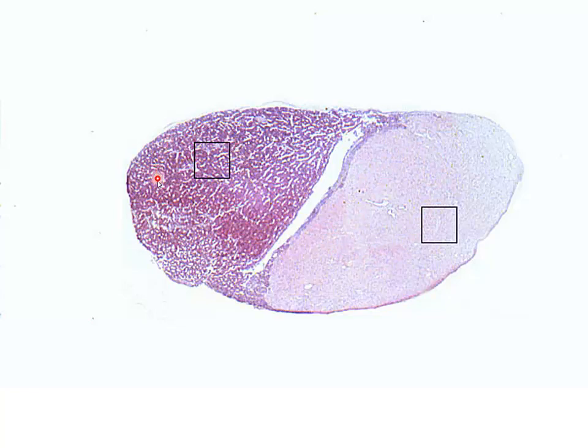And then here is the adenohypophysis and the pars distalis portion of the adenohypophysis, or the anterior pituitary. And here we have the pars intermedia. These are really the only parts that we're going to be able to see here. We're not going to see the pars tuberalis portion of this one, the infundibulum, those things. But this is our adeno, and this is our nervous portion.